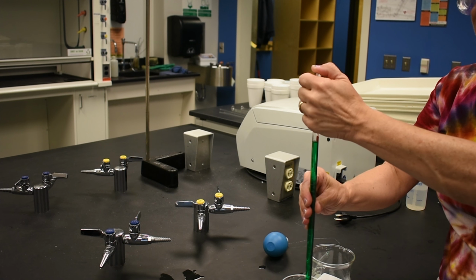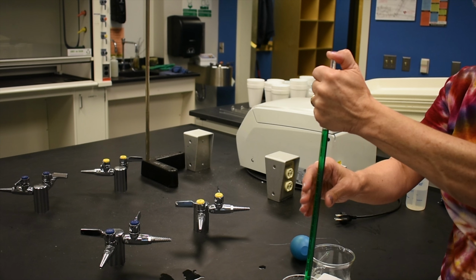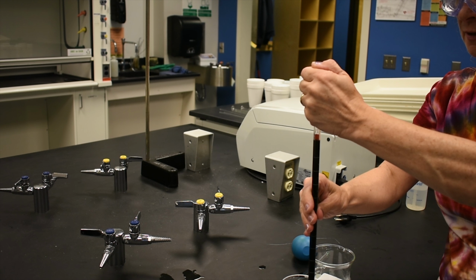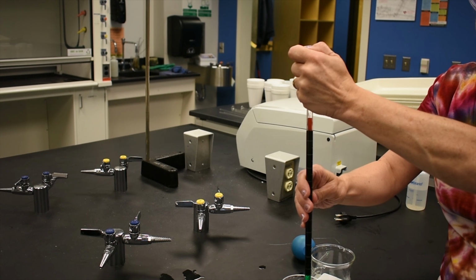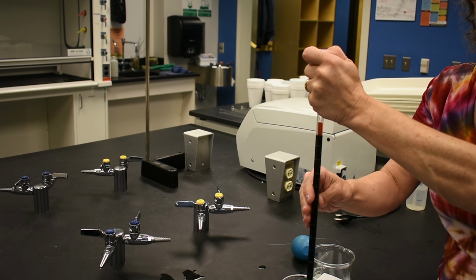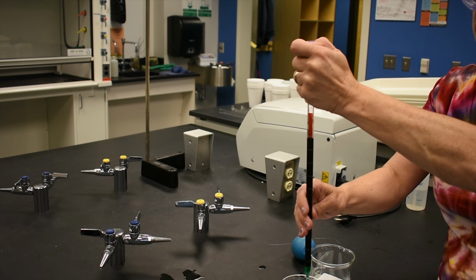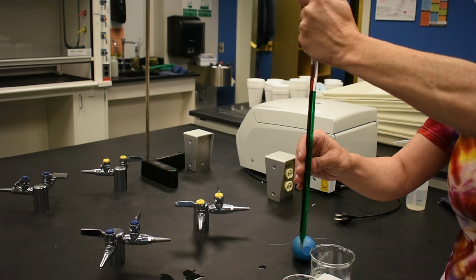All right, so how do we dispense a solution out of the pipette once we have it in? You can see my thumb right now is capping the pipette off and holding the solution in. If I remove my thumb from the top of the pipette, the liquid starts to drop and dispense out of the pipette. In this case, I'm not very concerned with having exactly 10 milliliters. So what I'm going to do is remove my thumb until the solution is a little bit below the 0 line.